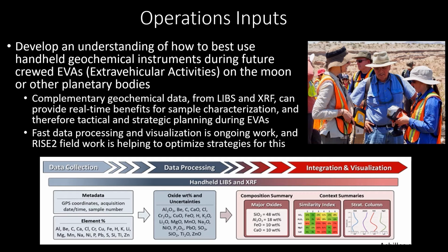And so the image on the bottom there was made by Shreya Achilles, who's also a member of the RISE team, and it shows an example data flow that is being worked on for processing this data from the handheld instruments through collecting the data, collecting the elemental data and the metadata, getting that processed to another level, and then finally getting it processed to the visualization level that would be most appropriate, most useful for astronauts during an EVA.